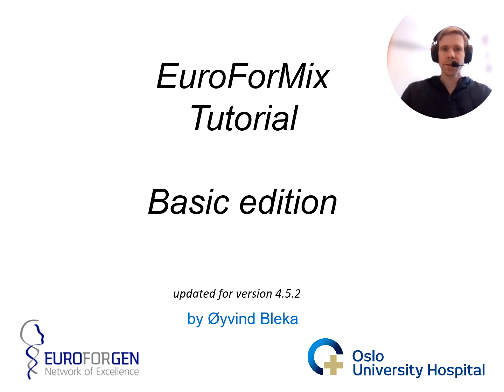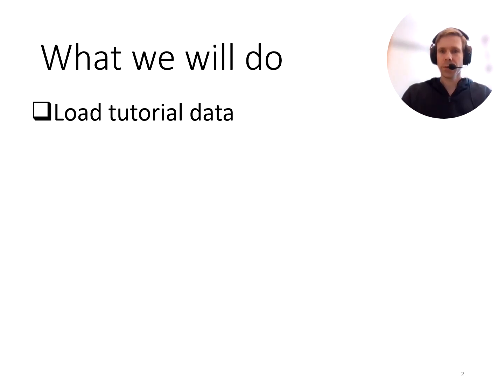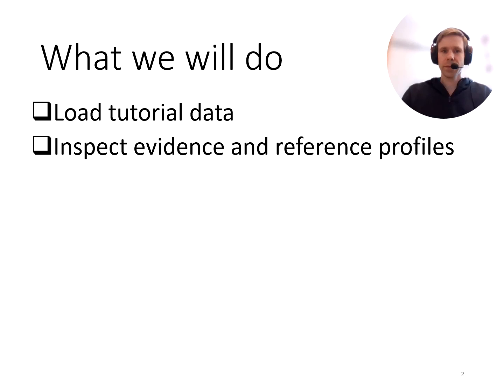Hello and welcome to this tutorial for using EuroForMix. This is the basic edition where we'll go through the most common features of the program. So what we will do in this tutorial is first to load the tutorial data. Then we will inspect the data, the evidence and reference profiles.